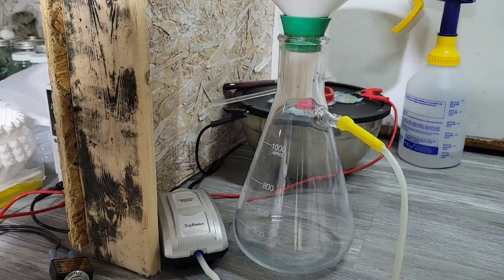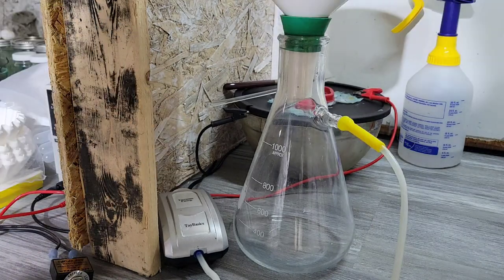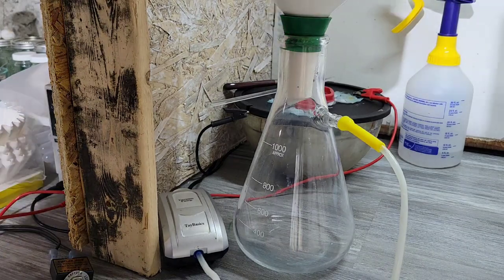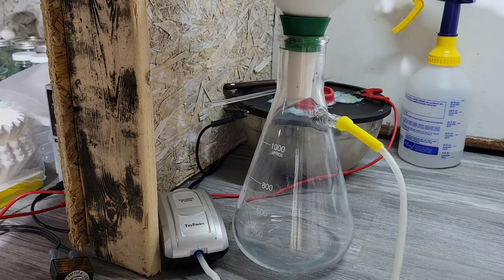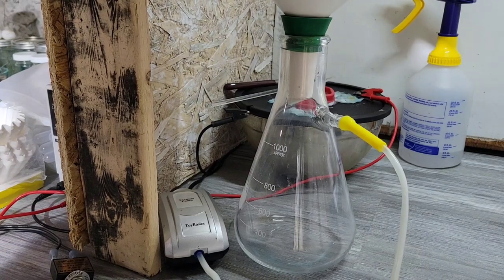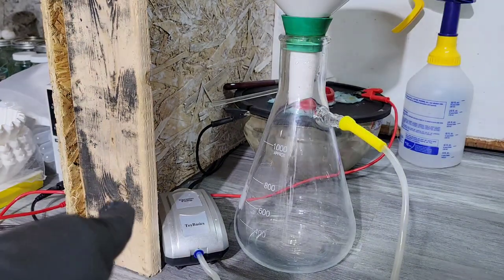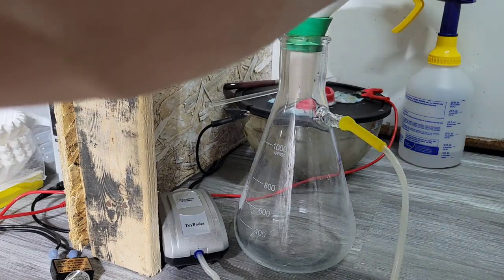One thing I don't like about that vacuum is the on and off switch is like a mile away. It's just the perfect amount to sit on the back side of the bench, so I gotta lean all the way over. I suppose there's bigger things to gripe about, but just in case you guys are in the market for a cheaper vacuum pump, that's my gripe about that. All right, and let's pour it in the filter.